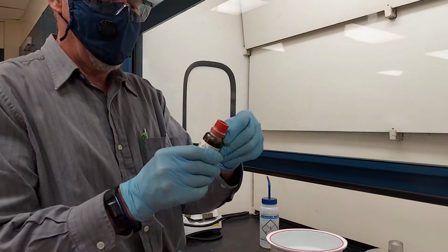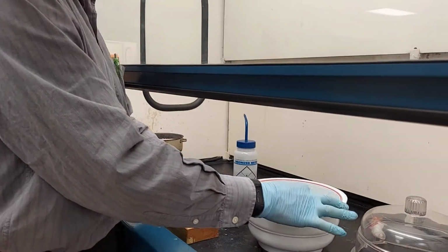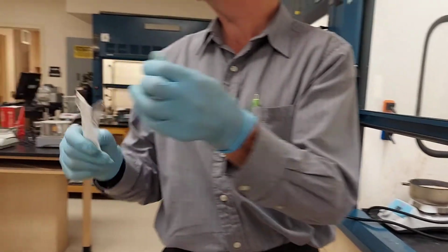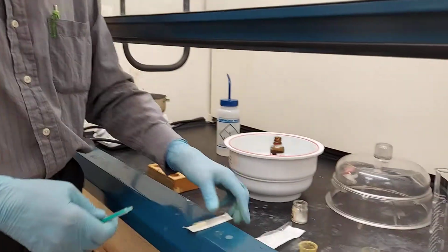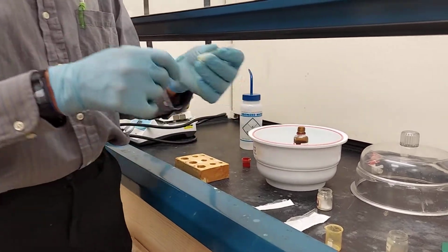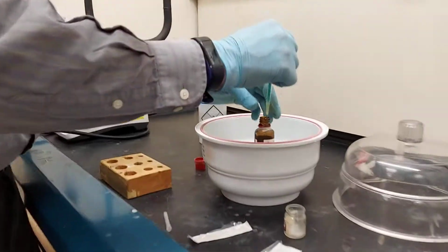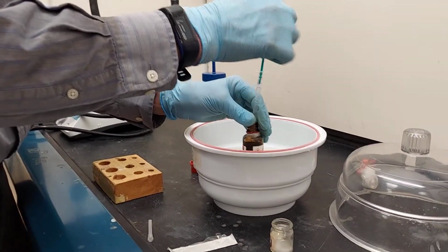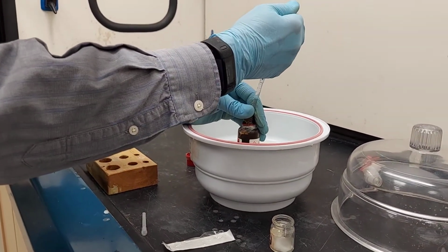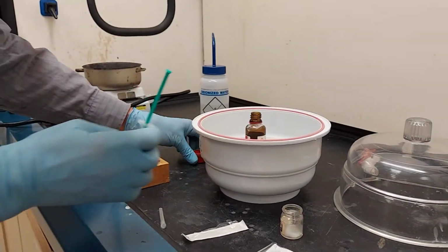All right. We also have acetyl chloride, another dangerous chemical. We kept it in a desiccator. We're going to use a new syringe. And how much acetyl chloride are we using? 0.72 grams per milliliter. 0.72 milliliters. Fill it up fast. And down to 0.72. There we go. Putting the lid on.